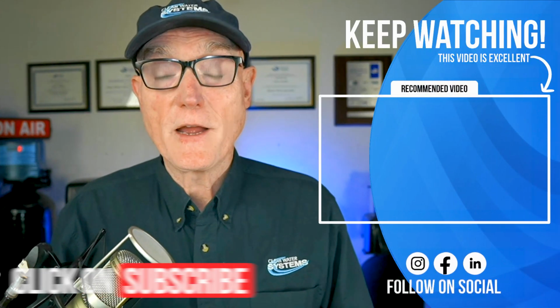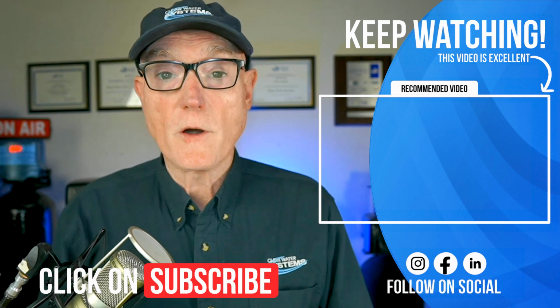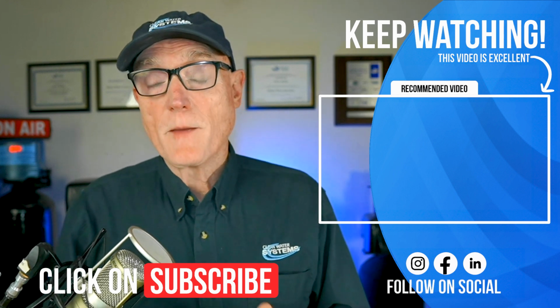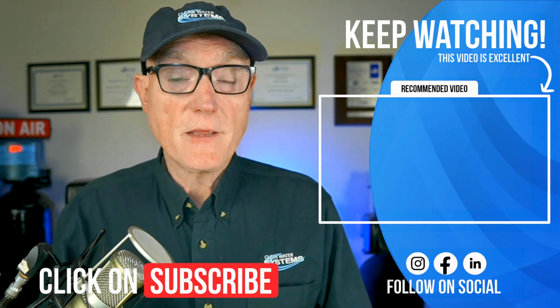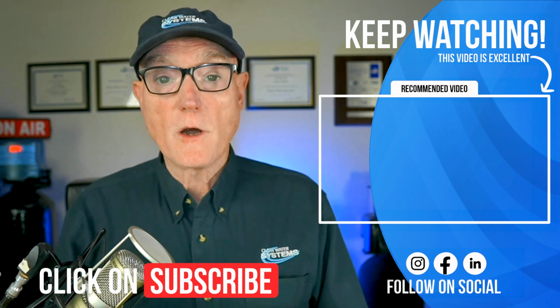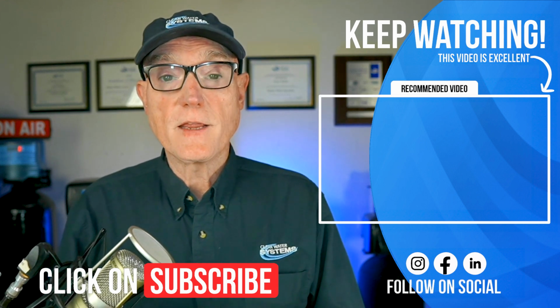So in this video, I gave you a good overview of how to read your SimpleLab water test report. That's why I made a series of videos that go over water treatment applications and water treatment systems that might work depending on your SimpleLab test report. So just click the video on the screen and I'll see you there.